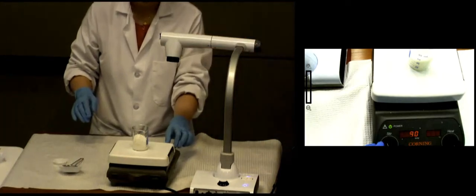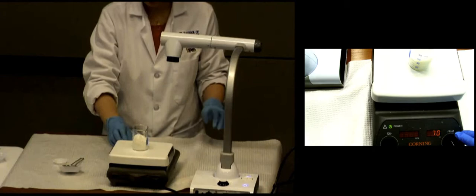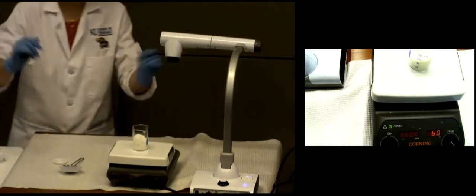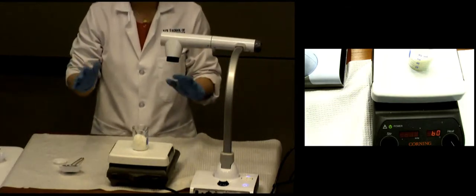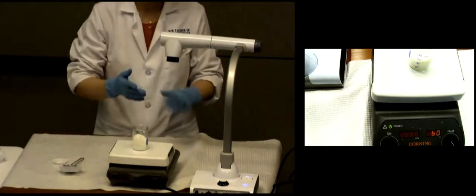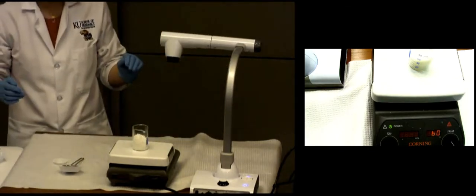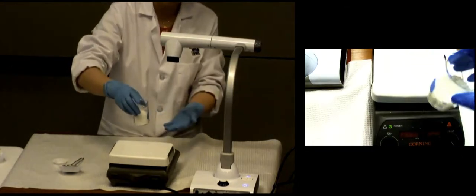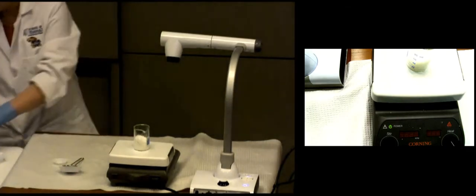All right, so we are not stirring yet. We're going to heat to medium heat, okay? And usually 50 or 60 degrees Celsius will be good enough for fatty base. And you don't want to go further up because you don't want to form the polymorph there. This is probably going to take about 20 minutes to melt. So once you melt a portion on the bottom, you kind of stir a little bit, keep melting until it's all melted in the end.